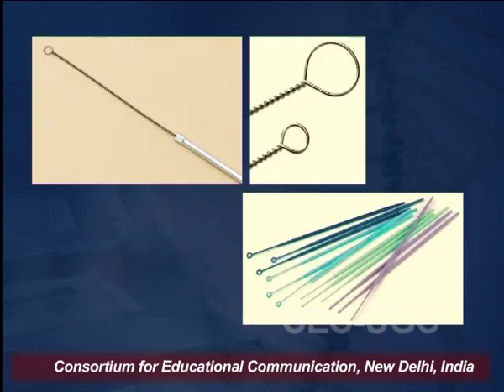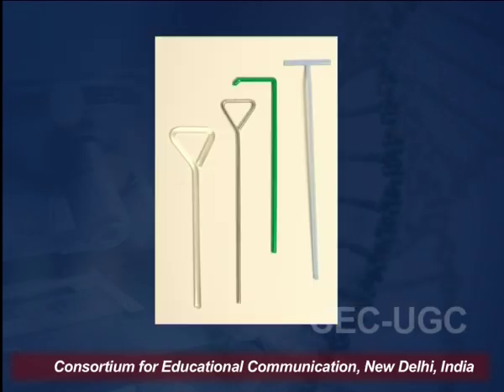These are the different types of rods or tubes which are used for inoculating the bacterial colonies. On the top you can see the metal rods. They can be used multiple times after heat sterilization. At the bottom you can see the plastic rods. They have a loop to pick a single colony, and these plastic rods are never heat sterilized. They are only used one time. After using, they are disposed of. Only the metal ones are heat sterilized and can be used multiple times.